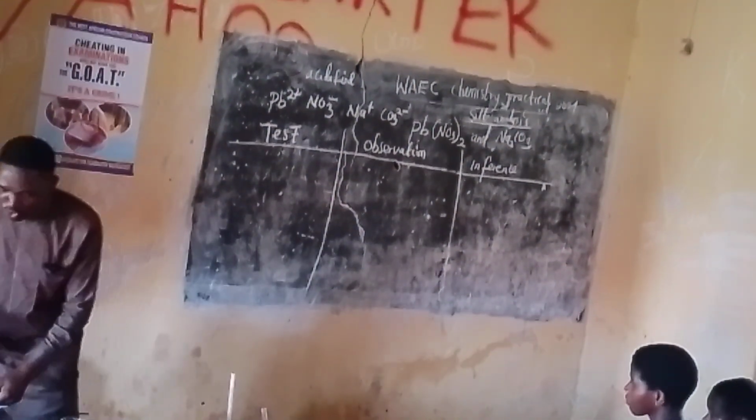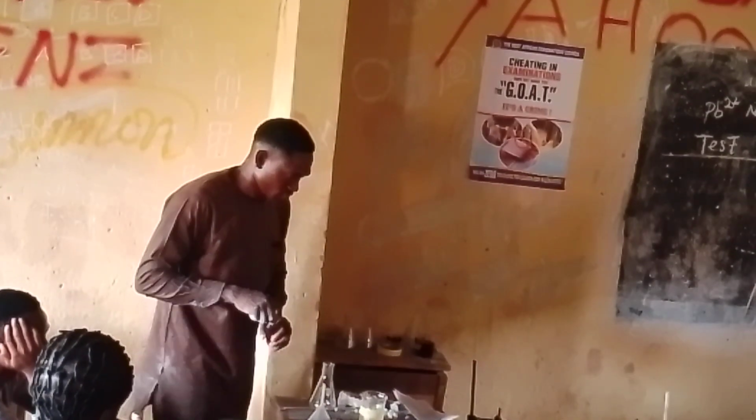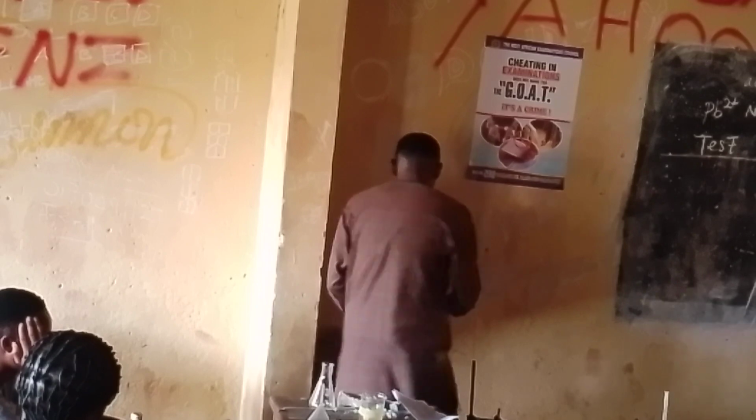For lead, I'm going to do that fast. Just demonstrate and you'll be seeing. Okay? Let me get our test tubes.